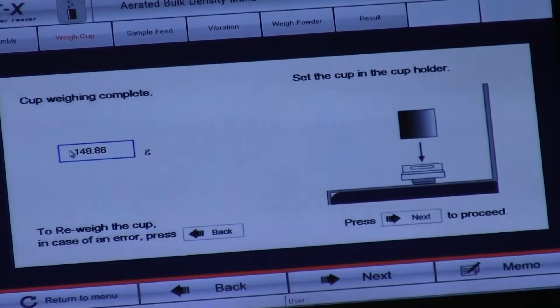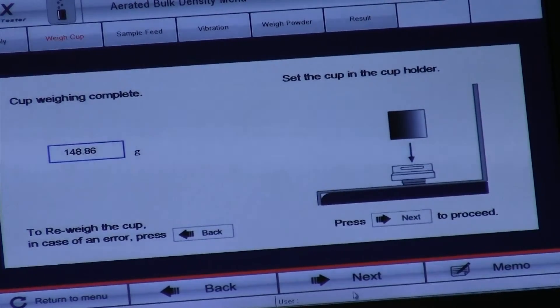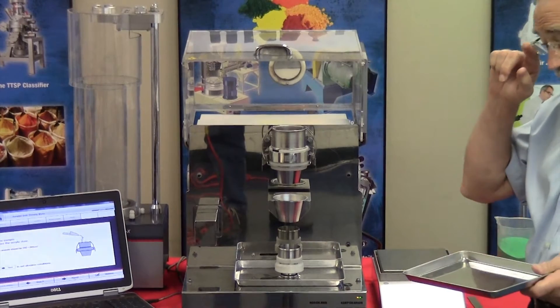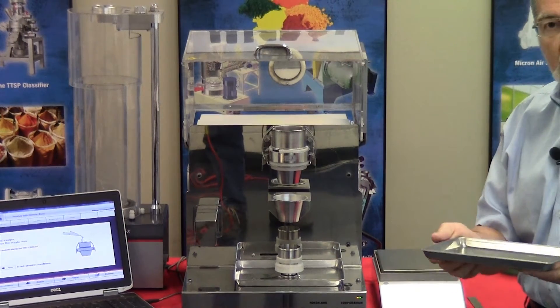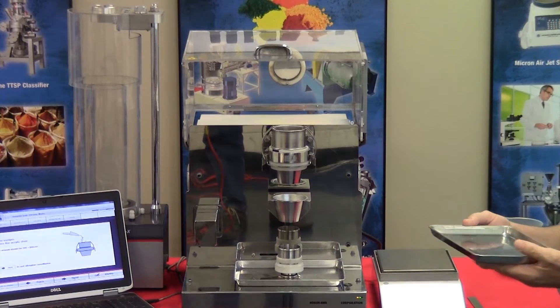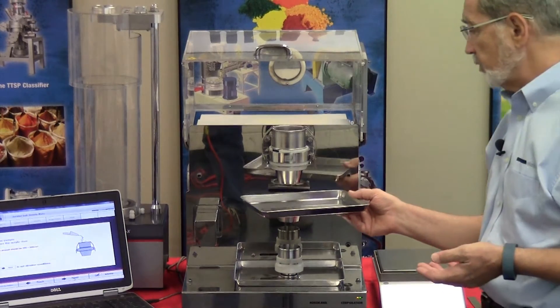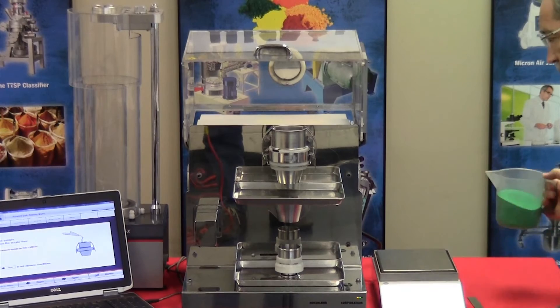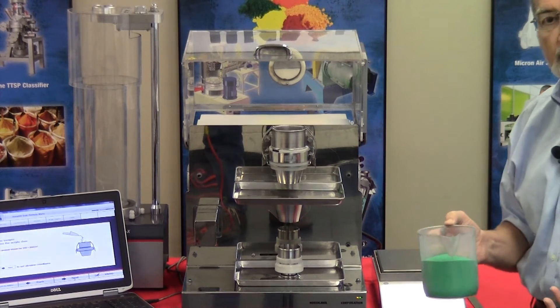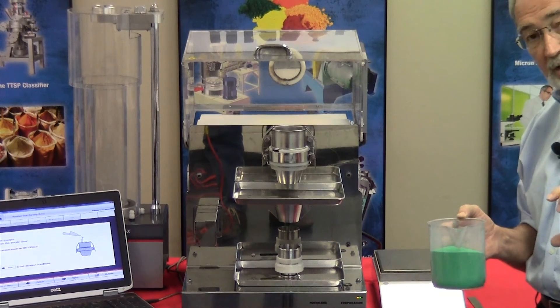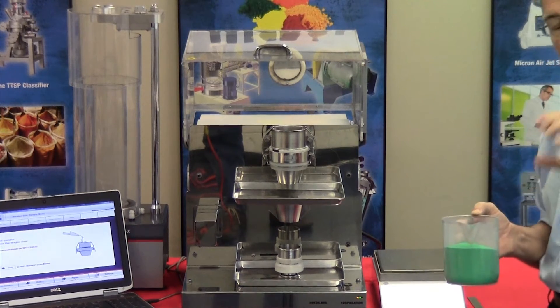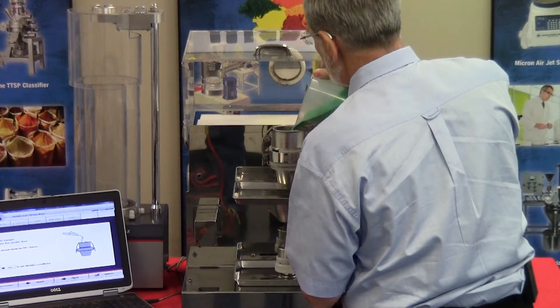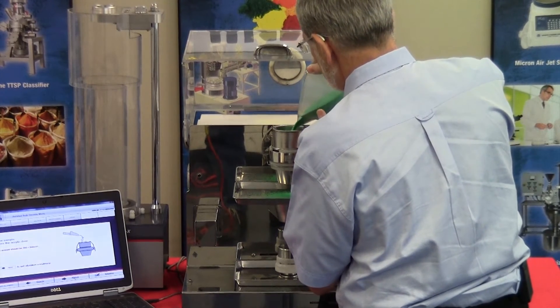It's approximately 149 grams, and now we add the material. Not shown in the software is a method we've developed to collect any material that may inadvertently pass through the screen prior to the actual test. We set the tray in place to capture any material that may prematurely fall through, because for the aerated test you don't want a stop and start, as that will compress the product. Some of the material has actually fallen through.